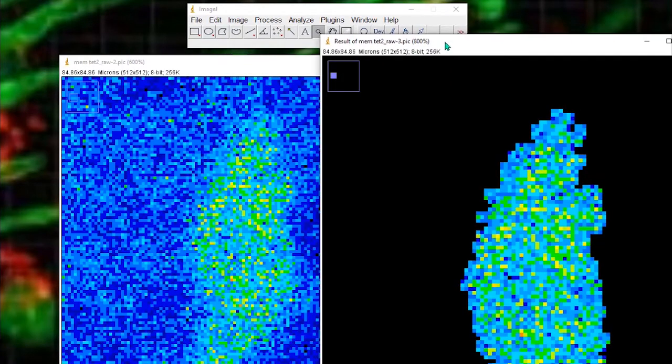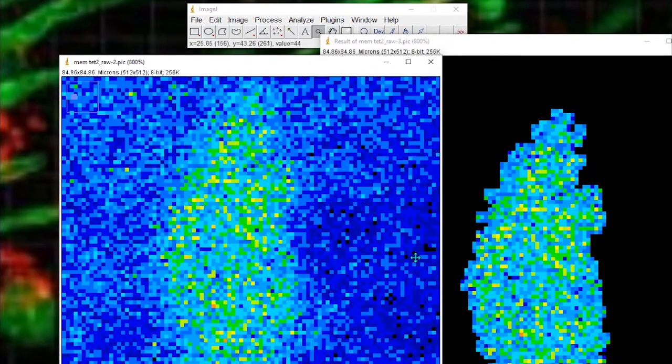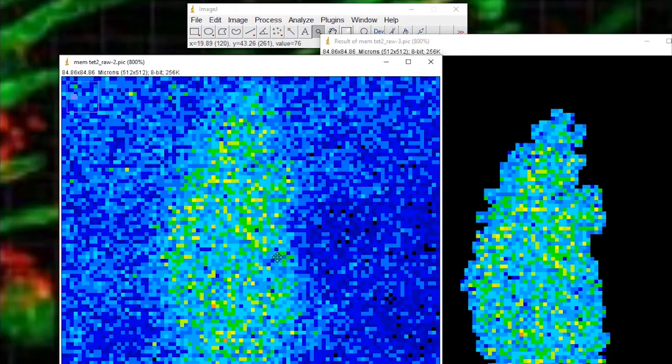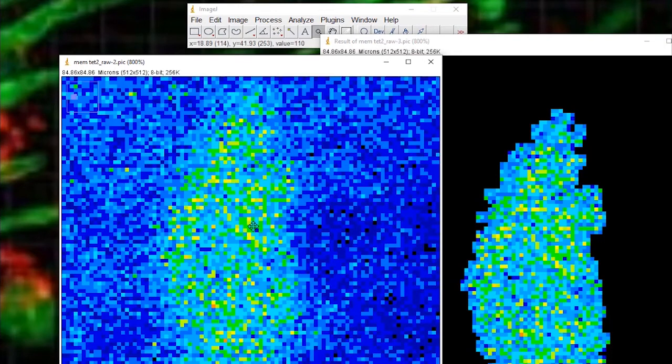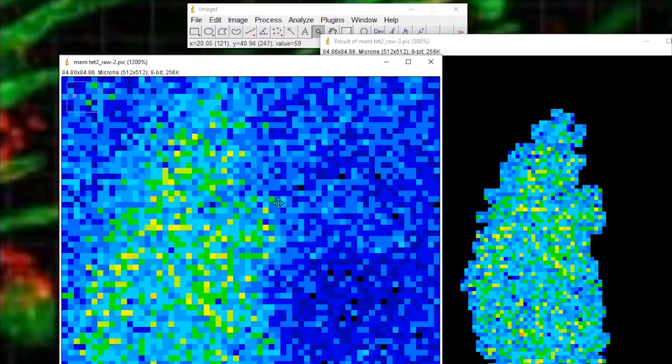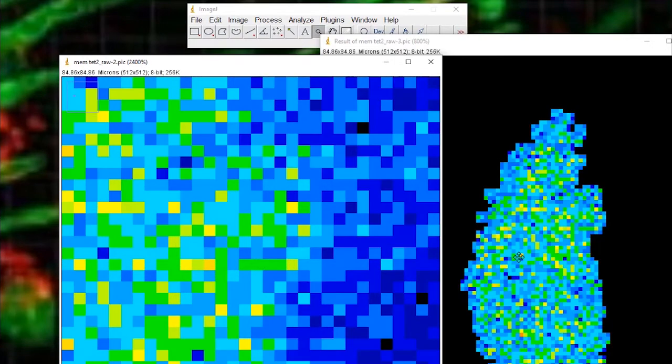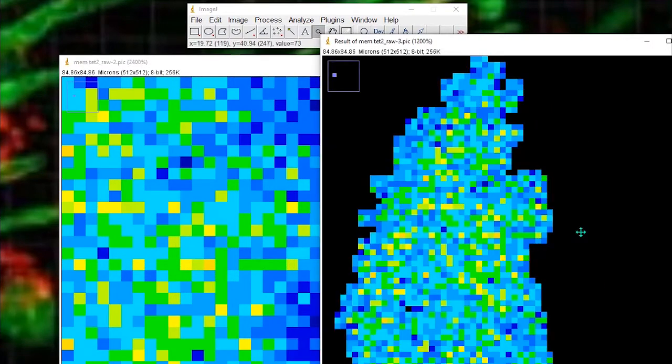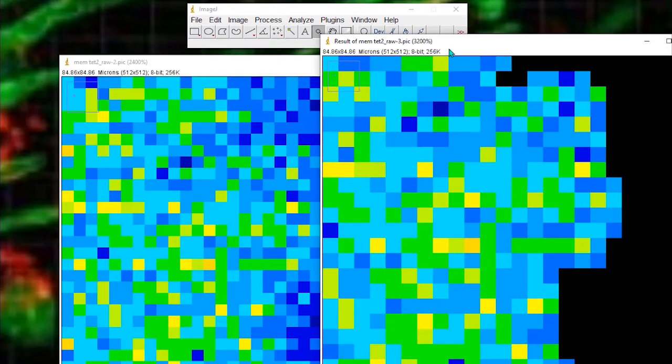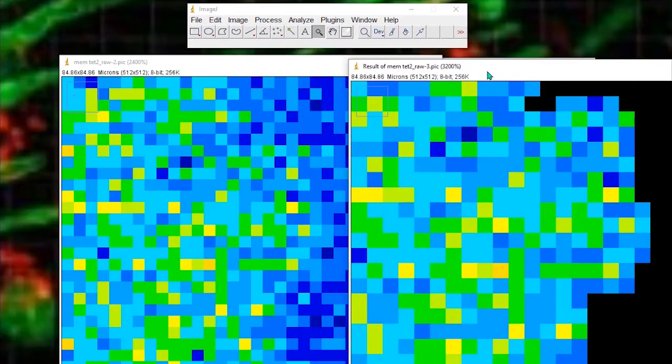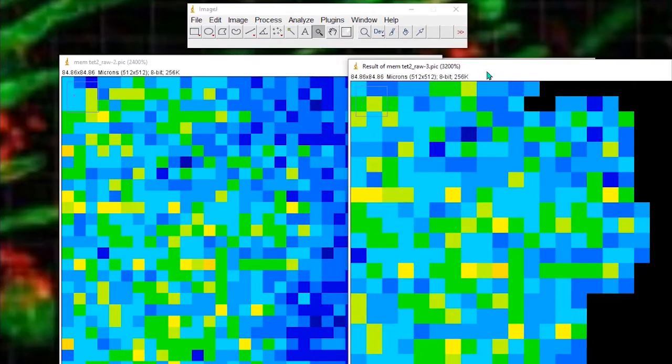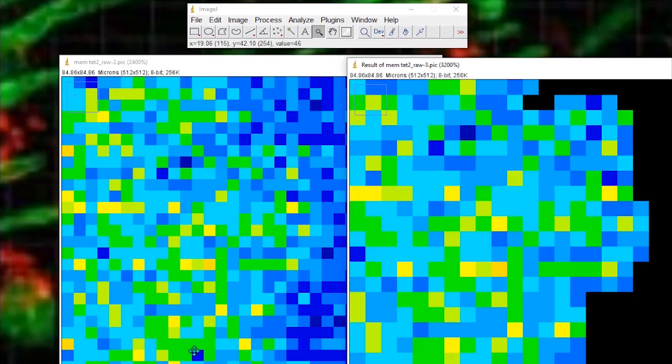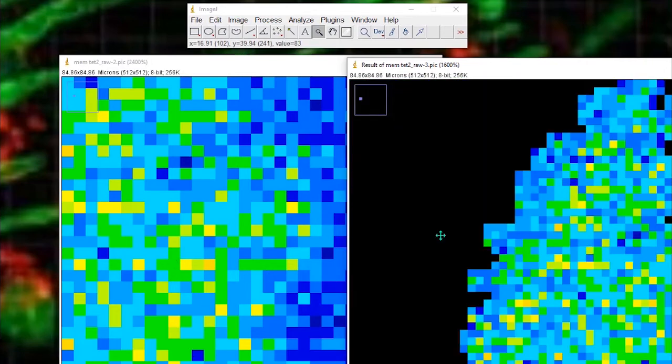And I think you can see quite clearly, if I find an area, yellow there. There you go. Slightly different magnification here, but I think you can see anywhere you look, you'll see the same pattern of pixels. So the intensity hasn't changed.